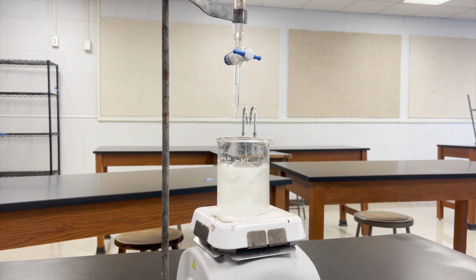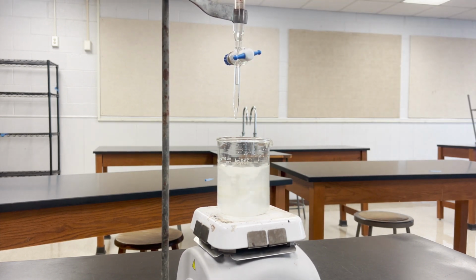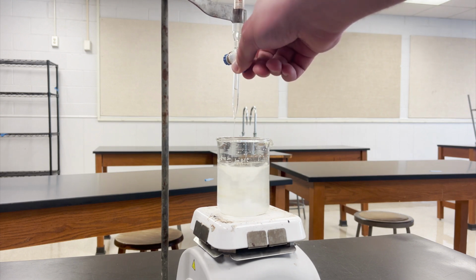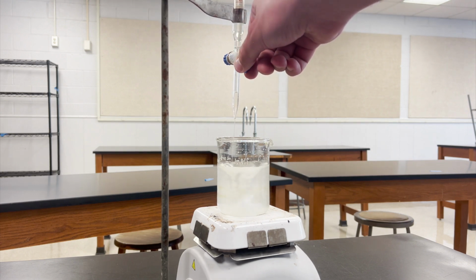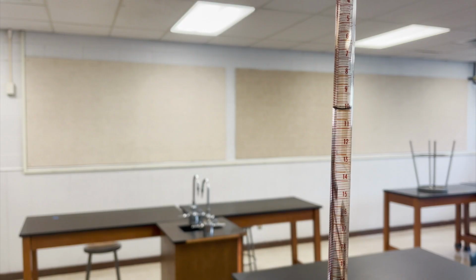And what we're going to do is put in some sodium hydroxide. Now the directions tell us to put 1 milliliter in at a time, but I happen to know that we're going to at least need to put 10 milliliters in there first. So I'm going to go ahead and just put 10 milliliters in there. And notice how it's now at 10 milliliters.